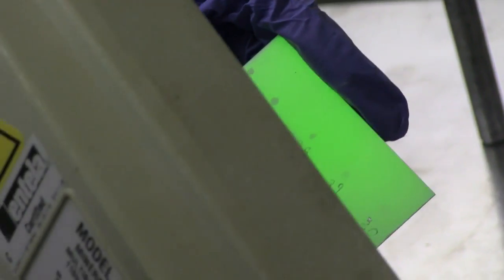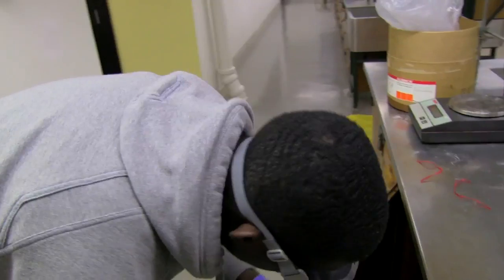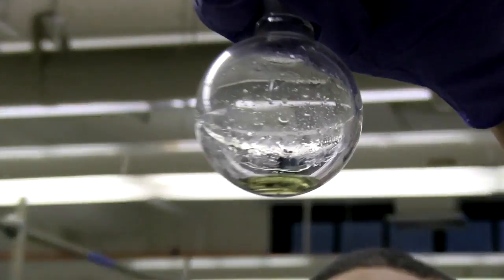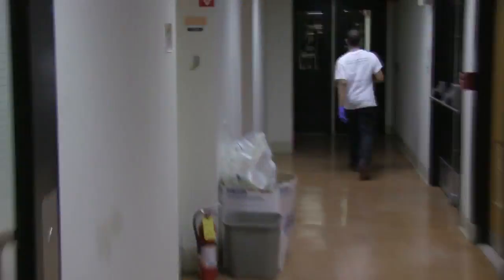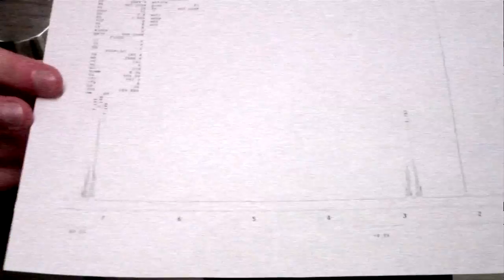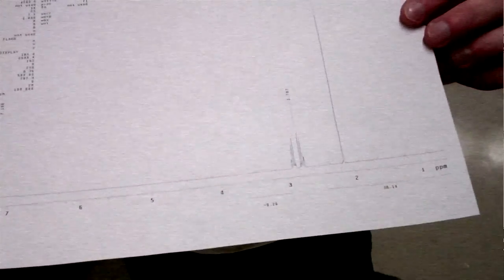This is exactly what I would want, right? Yeah. I'm finally finished. I just collected my stuff. But in the end, everyone runs a great column and purifies their product. My sample is pure. There are no other peaks where there shouldn't be peaks.